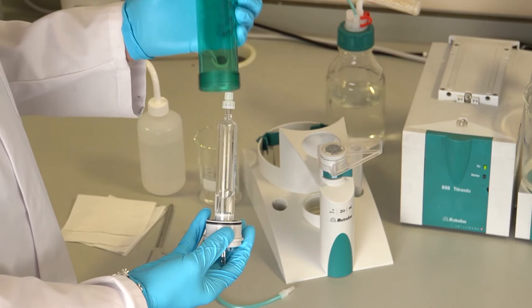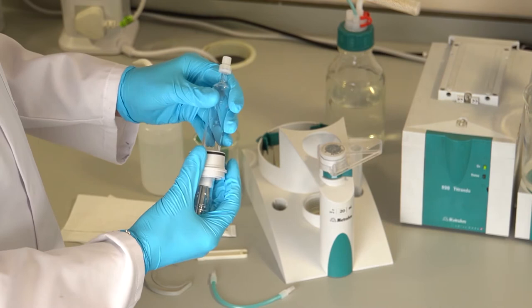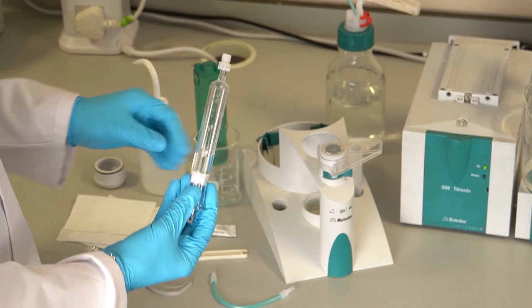Inspect the o-rings for damage and replace if required. Check whether the glass cylinder has been attacked, for example by aggressive alkalis, and also check whether solids have precipitated out.